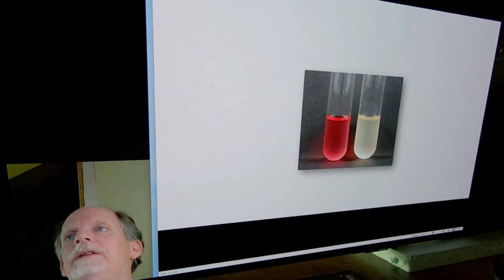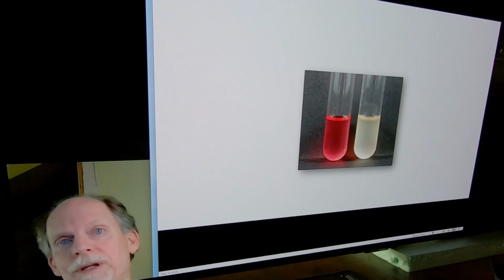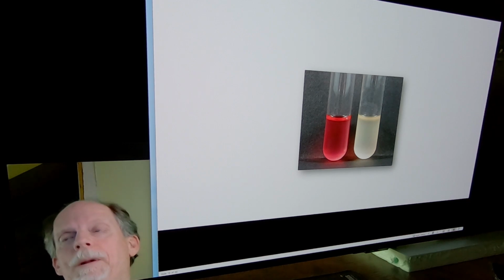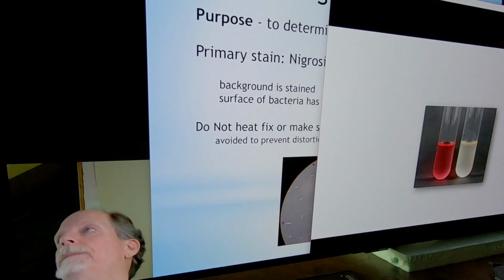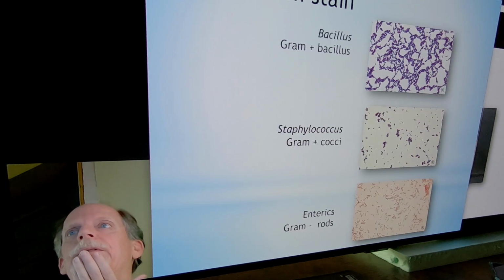And so I think this will be helpful having this. Now, this one is for the methyl red test, right? But the MRVP media is what's used for this. So if I ask, what's the name of the media used for this test, it would be the MRVP media. Okay. So anyway, I think that one will be helpful.